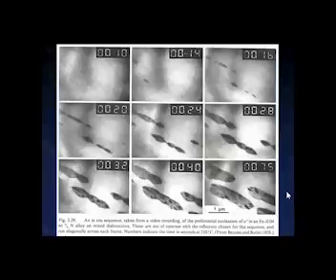and this is an example of figures which were extracted from an in-situ video recording from experiments that he had done. If you notice from the scale markers in this figure caption, this scale marker over here on the bottom right-hand corner is 1 micrometer, which is basically on the order that one would achieve with optical microscopy. And since these experiments are done using a high-voltage electron microscope, the specimens are a lot thicker, and so there is really no quantitative information at all.